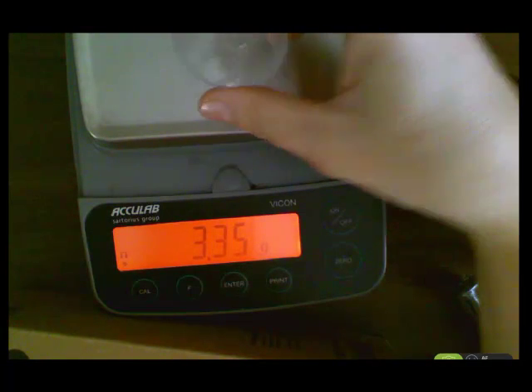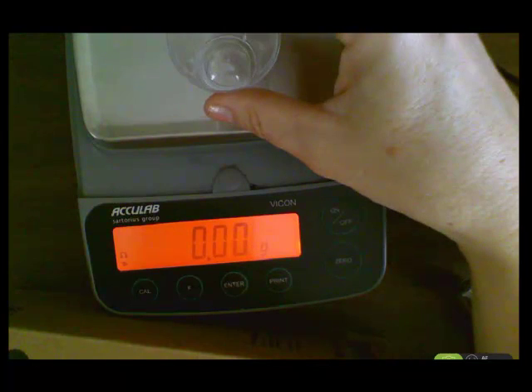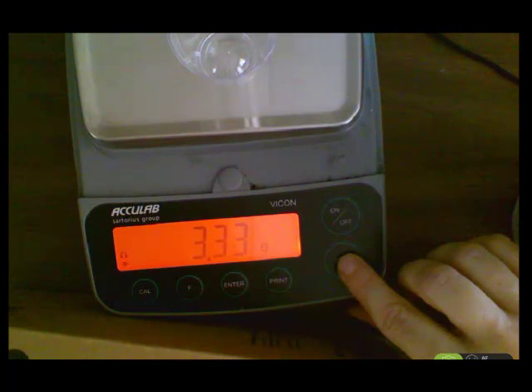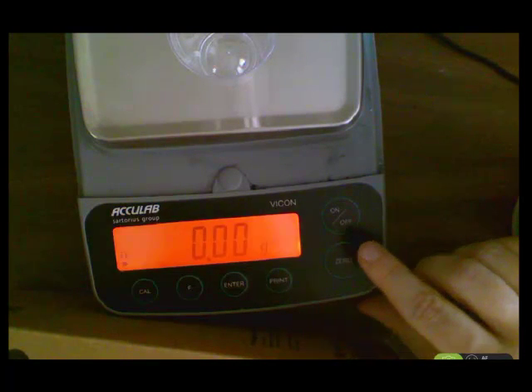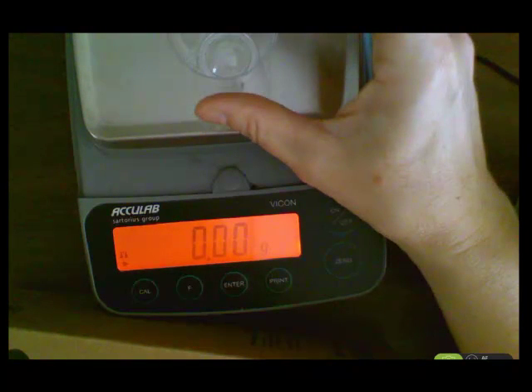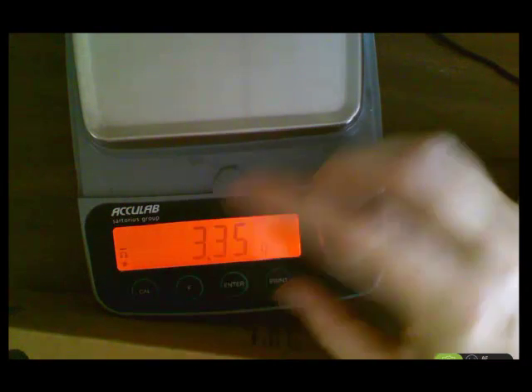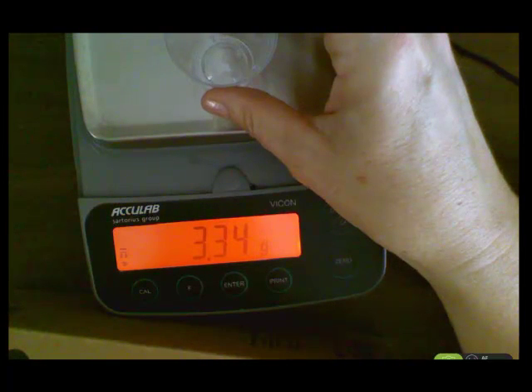So if I want to subtract the mass of my container, this cup, I place that on the balance, and then I press the 0 button and wait. And you'll notice the balance resets either to 0 or 0.01. So notice if I take the cup off, it shows the mass of that cup, but there's a little minus sign over here. So that means it's going to subtract that amount off from whatever I put in that cup.